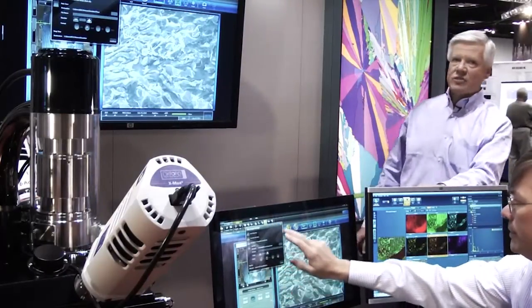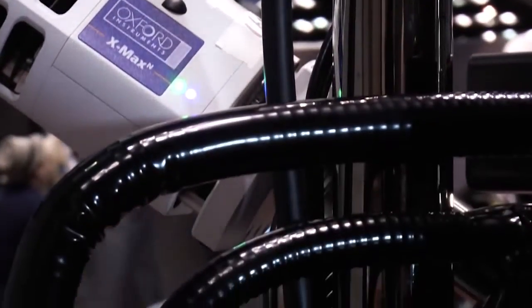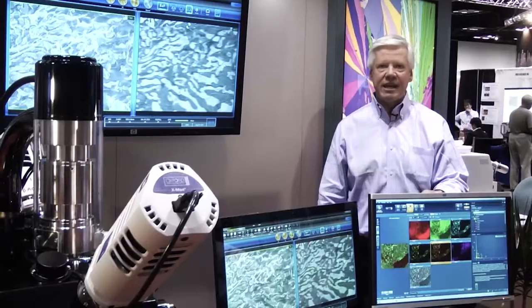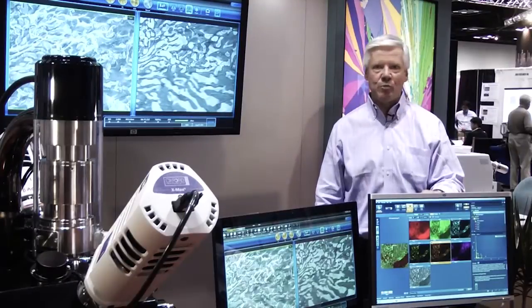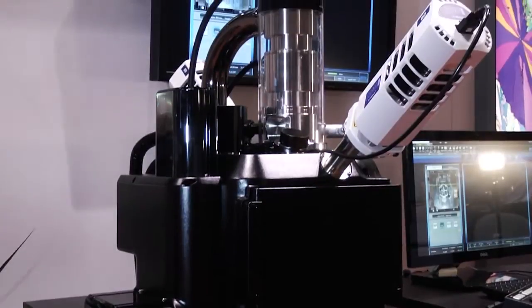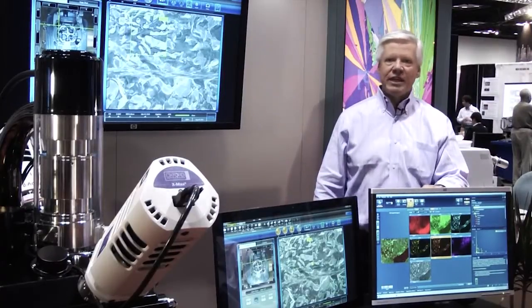The interface has been improved to be an intuitive interface with live color image navigation — essentially global positioning for the microscope. We can take images from a cell phone, from an optical microscope, metallograph, or polarized light microscope, import those images in, and do stage navigation and x-ray analysis.